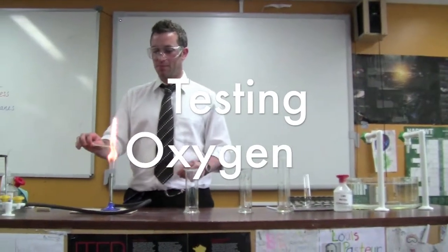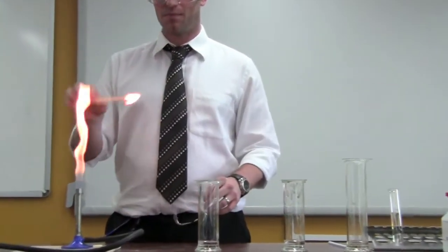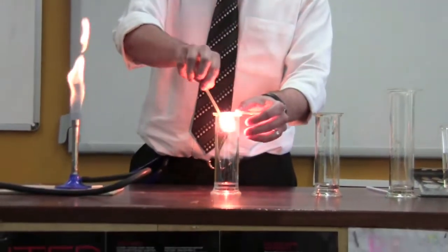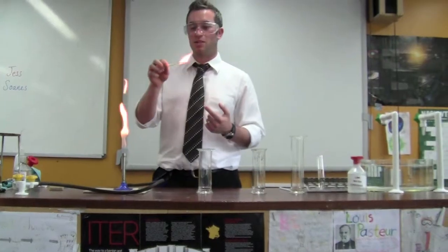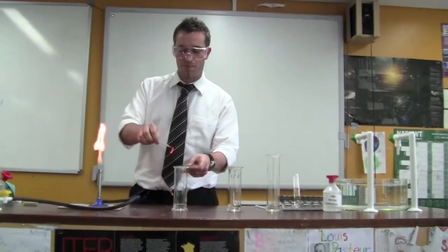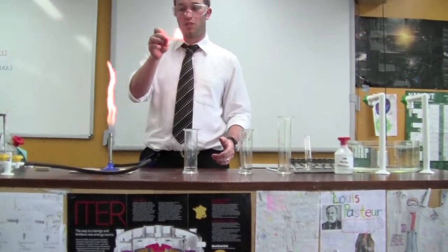You're going to need a Bunsen burner and a splint. You light your splint, blow it out, and put it into the oxygen. If there is oxygen, the splint will relight back into full flame. That proves we've got oxygen.